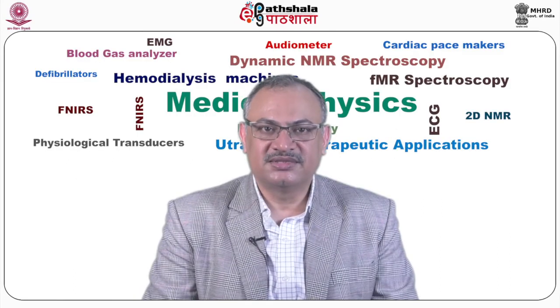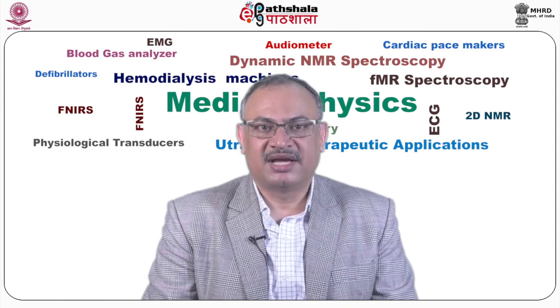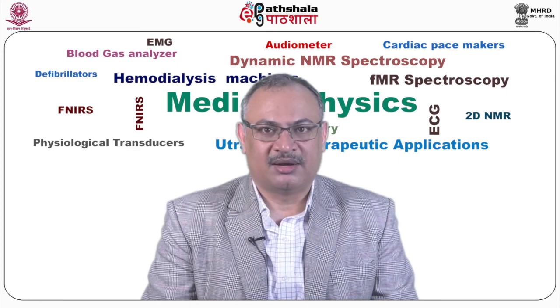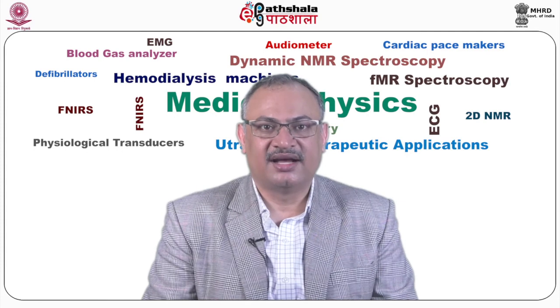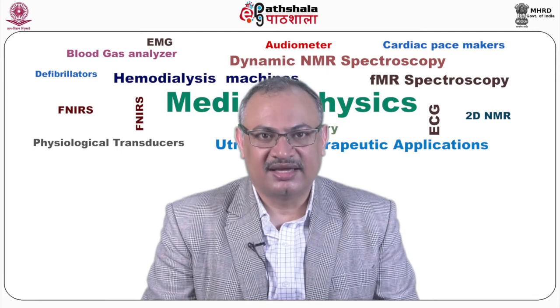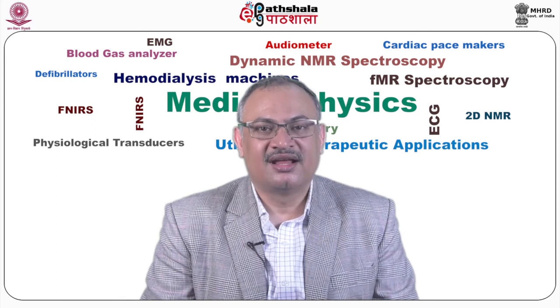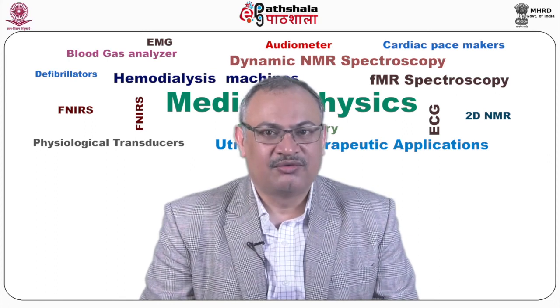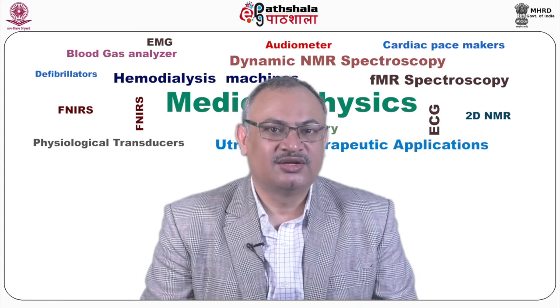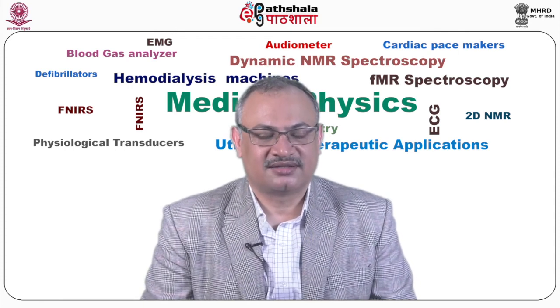The side chain carbons are frequency labeled. From here, magnetization is transferred to the carbonyl carbon, onto the amide nitrogen, and finally the amide hydrogen for detection. This spectrum correlates the H, N from the amide group with the carbon side chain of i-1, from the side chain of the preceding residue. It is especially useful for assigning the side chain carbons of proline residues.